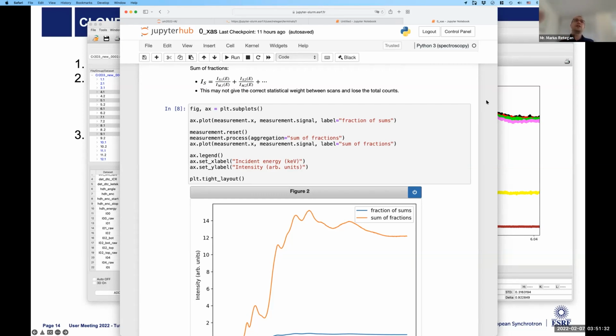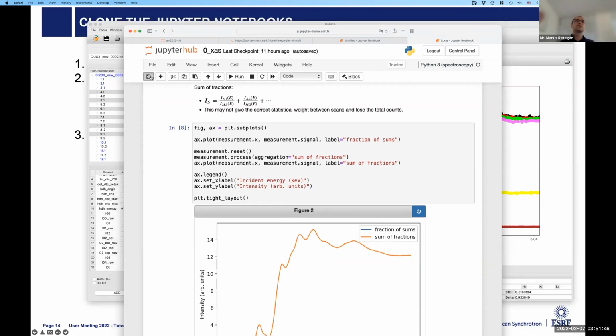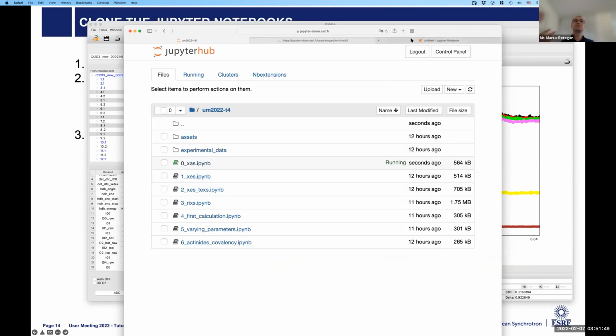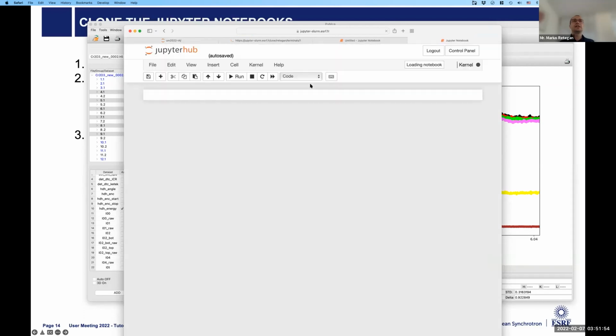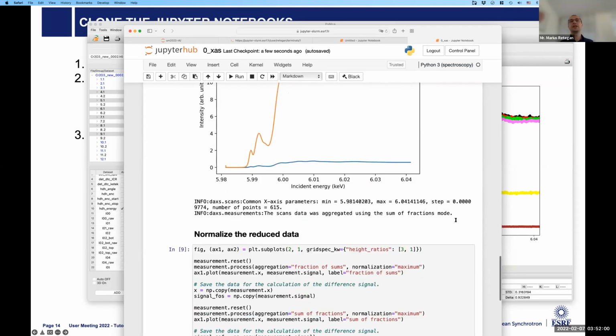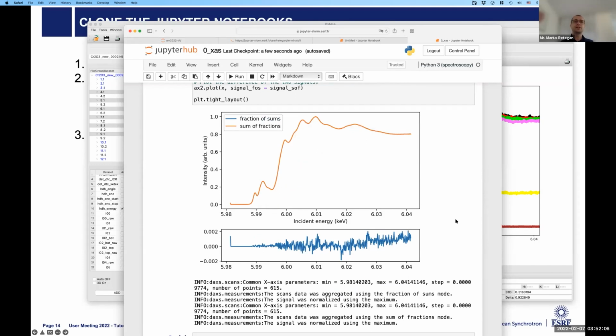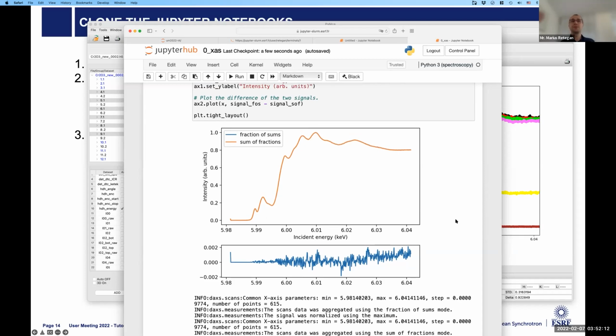The idea of developing this type of library is to provide a relatively simple way to do this in Python. And also the advantage of doing this in a notebook is that once you close this notebook, so you save it, and you open it, let's say, a few months from now, and you want to look at the data, you're going to have the plots that you made and everything that resulted from your analysis still there. So you're going to have basically something that is reproducible.